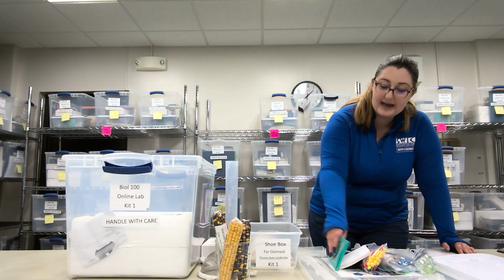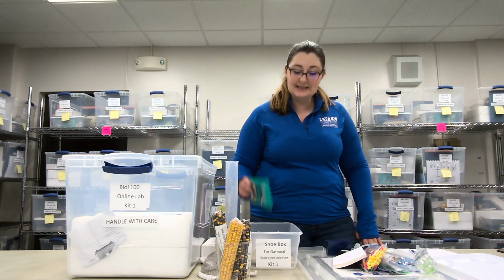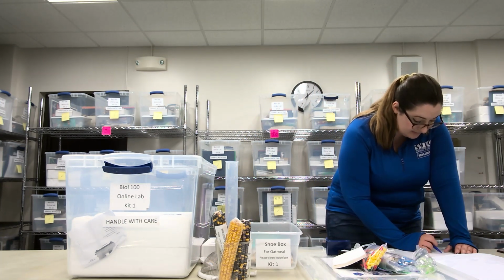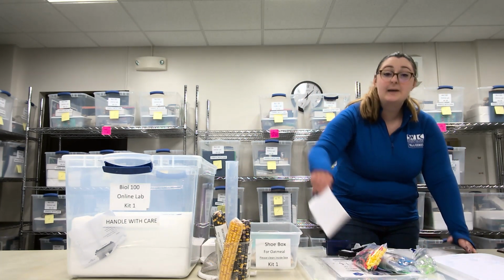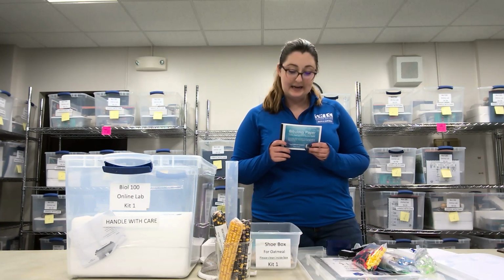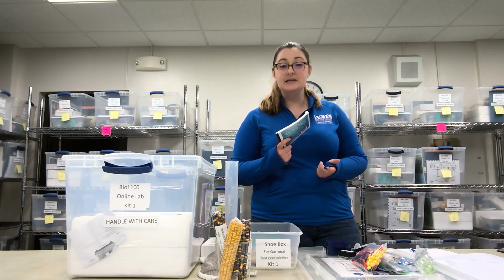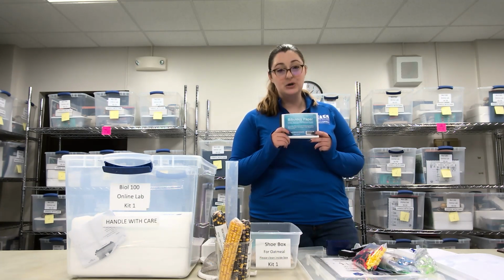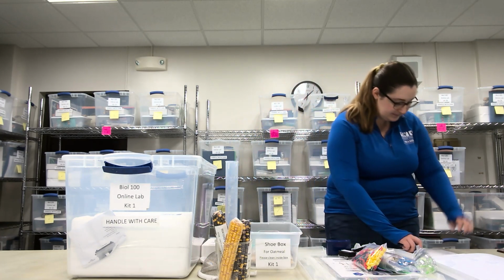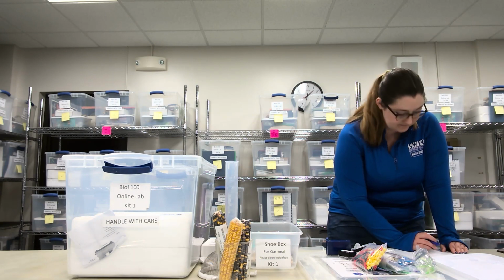From there, we have a box of colored pencils. Go ahead and put these into the box as well, and check them off. Next up is bibulous paper, which is a very fun word to say. This paper is very thin. You will use it to clean the slides as well as the microscope if need be. So bibulous paper, go ahead, put that into the box. Check off the bibulous paper booklet.